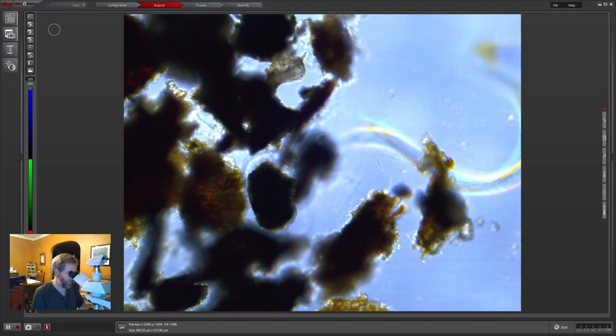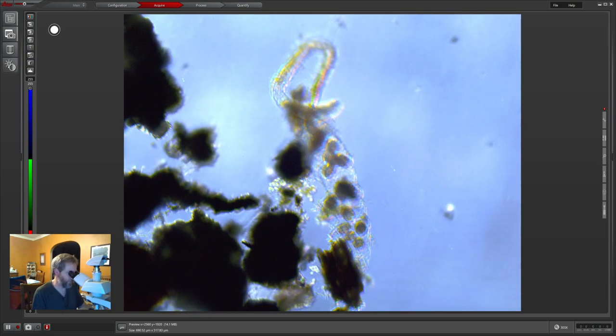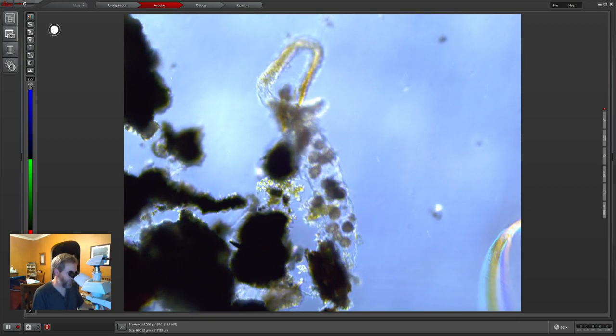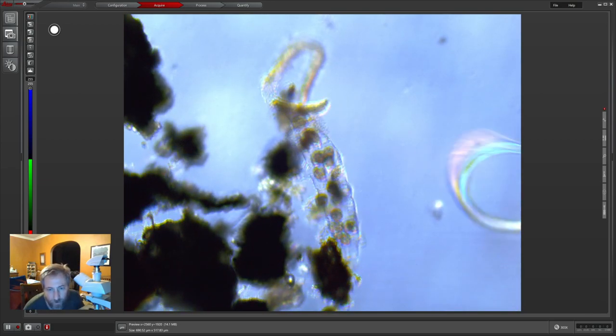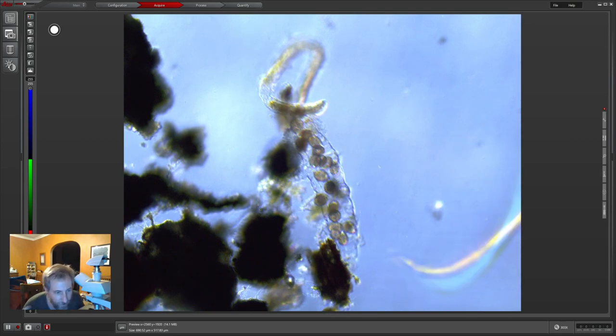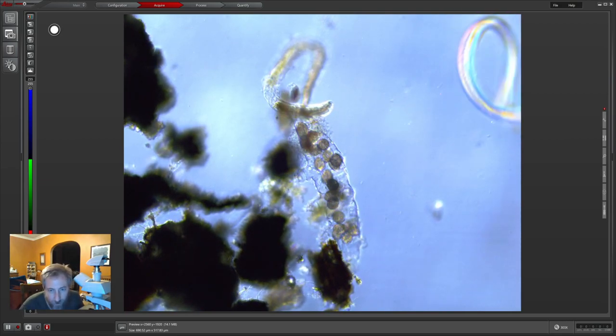That nematode's dancing around. This is what I was looking at when we first started the stream — I'm pretty sure those are little water bear eggs inside of the molt. You can see them kind of spinning around inside the molt itself.